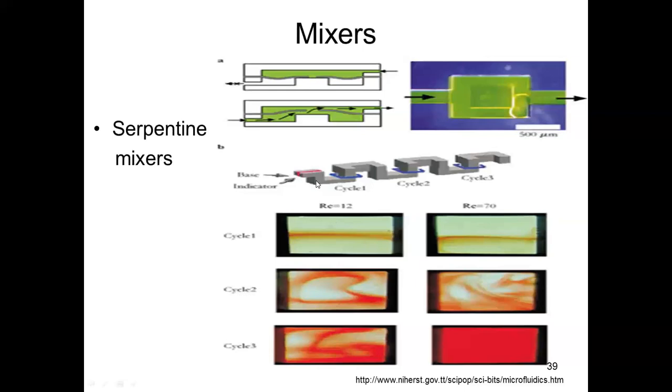And if we would take it through these cycles, around these bends and changes in volume, and we cycle it through and run it through here one time, and then we run it through a second time, and then a third time through this geometry, this is what happens to our mixture. So we can get a pictorial vision of what happens.